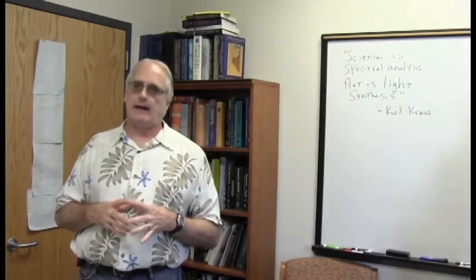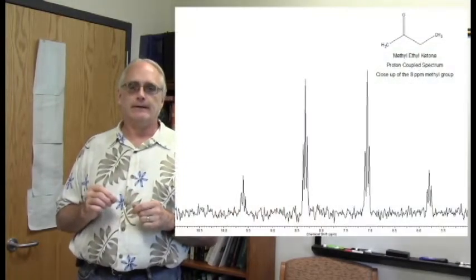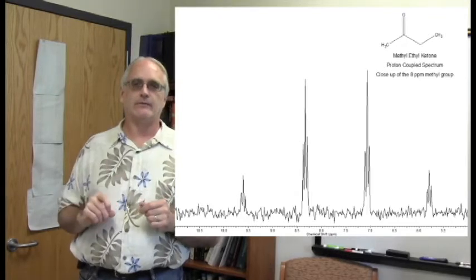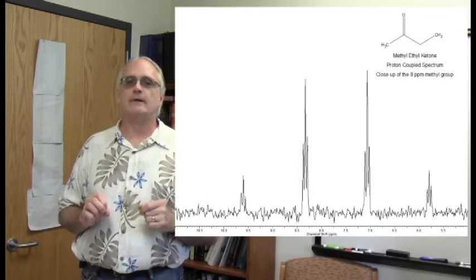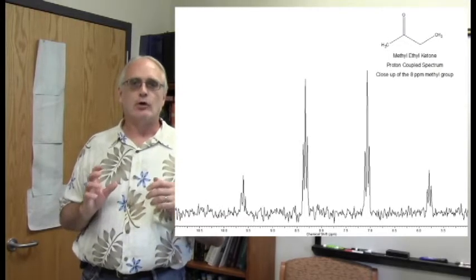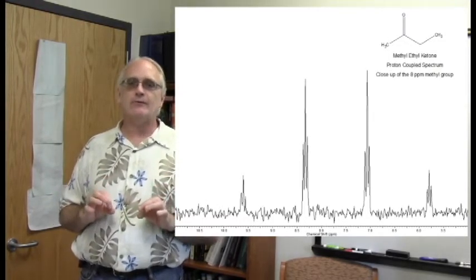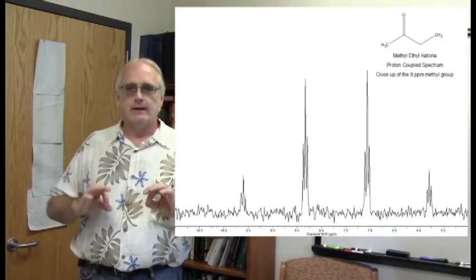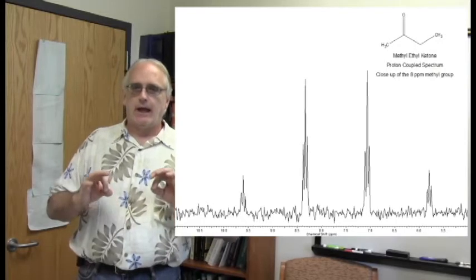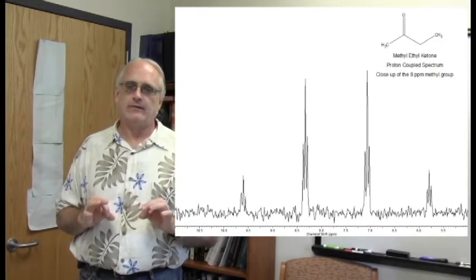Take a good look at this close-up of the methyl group at the end, part of the ethyl of methyl ethyl ketone. This is an extreme close-up of the quartet signal at 8 ppm. When you look at it carefully, my gosh, do you see a quartet of triplets staring you in the face?